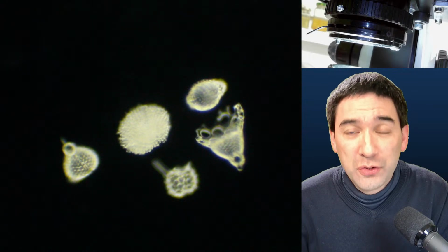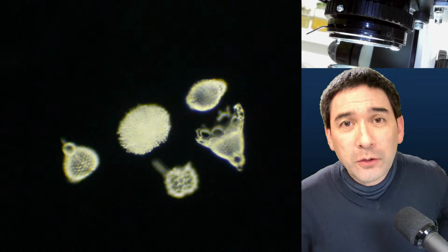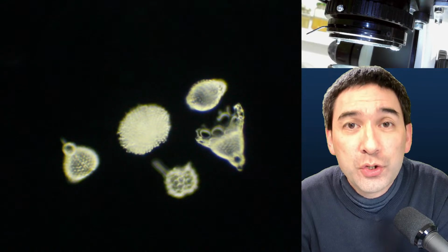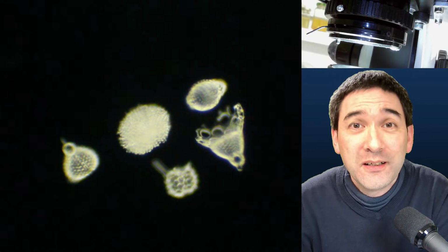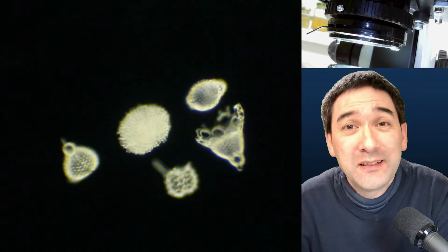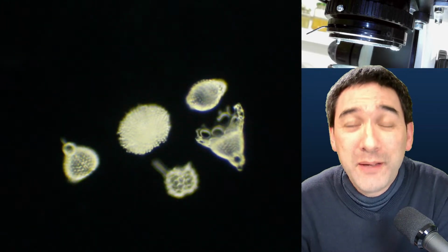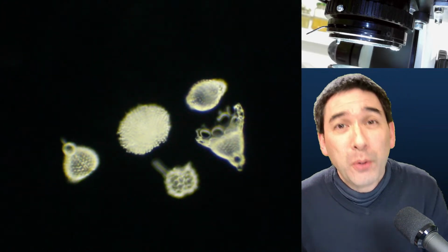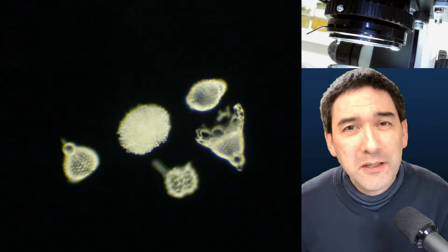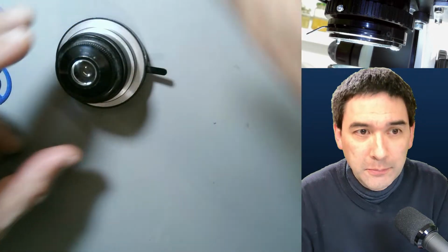So what I would like to do first is give you a little bit of background information. You probably already know that I have a microscope which is able to use DIC, differential interference contrast. It's a pretty fancy technique, and DIC microscopes give very beautiful, colorful images, and also a little bit of a three-dimensional view, even though it's not really three-dimensional, it just appears like that. But it is possible to imitate this a little bit by using appropriate filters. And what I would like to do, for maybe 10 minutes or so, is give a little bit of a theory section here. I also prepared a couple of slides.